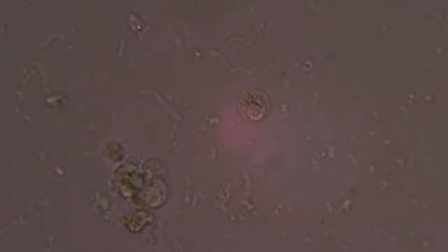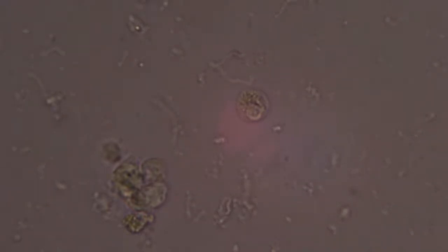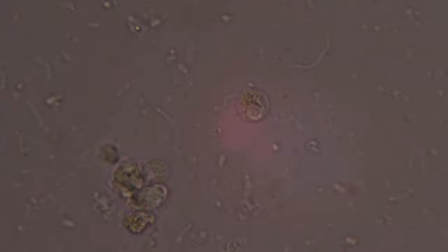Another thing I want to do in the future, I didn't put it in this time. Well, maybe I could try it with these. It'll just change the light a little bit, but this German guy, Rheinberg, came up with this clever illumination type called Rheinberg illumination. And you can use these colored filters. They're gradients, bullseye patterns, solid color filters. And when you put them in here, you get some pretty interesting results.